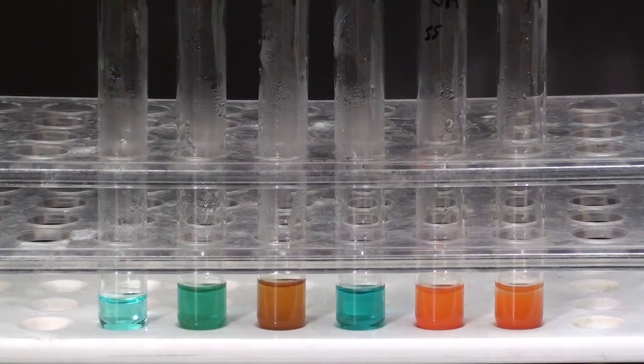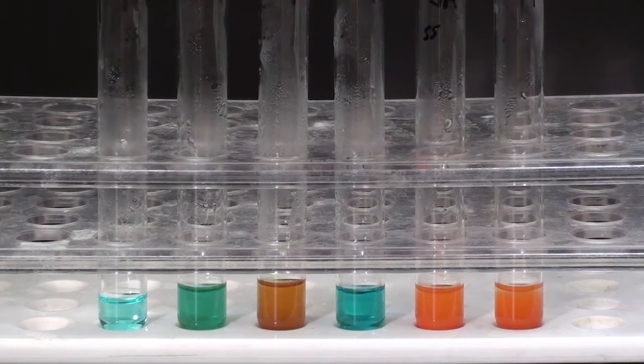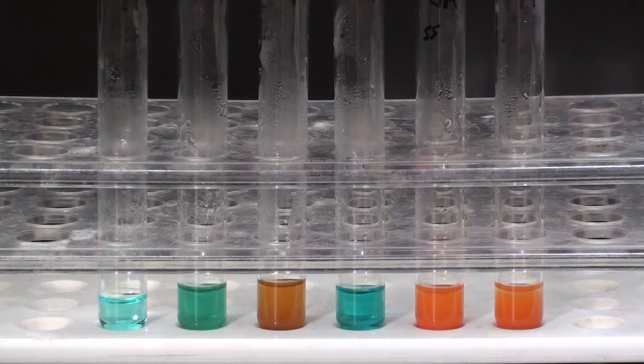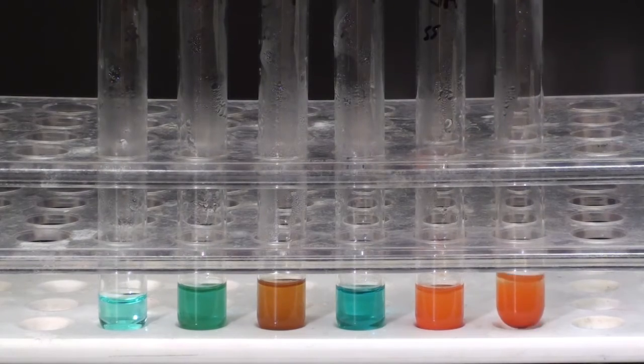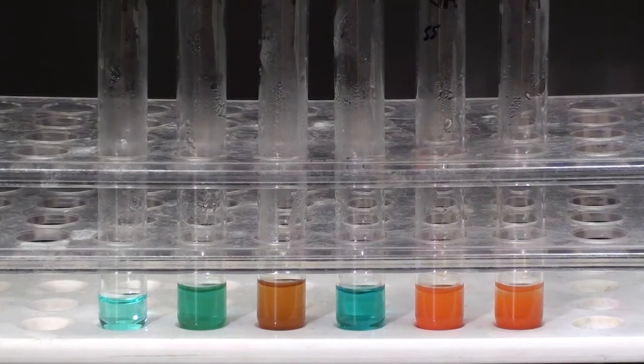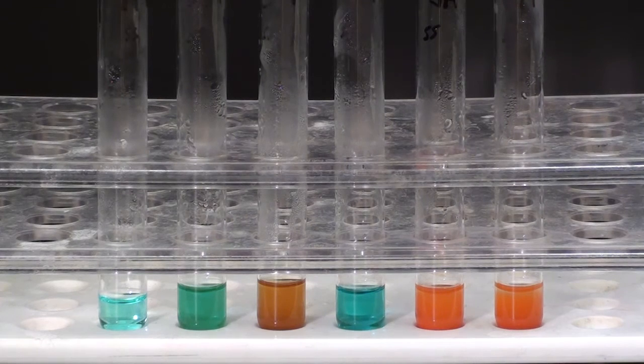Test tube six was enzyme and starch left at zero degrees centigrade for 30 minutes. But the explanation for why sugar is present is that enzyme and starch were at room temperature when they were put into the cold.